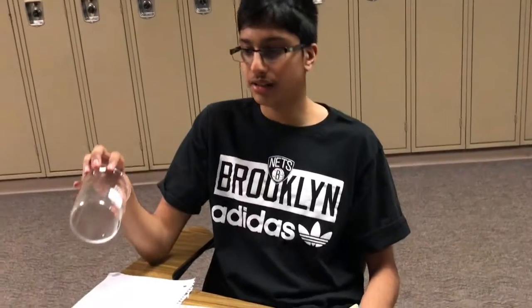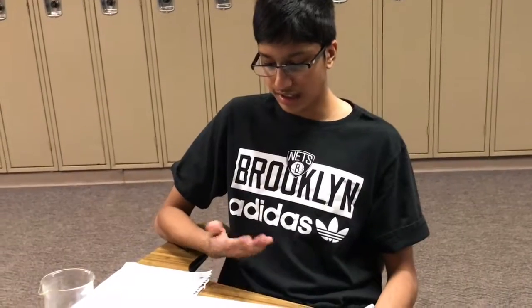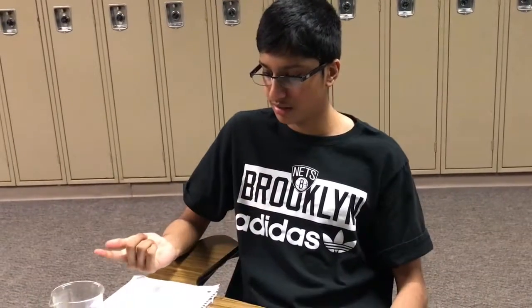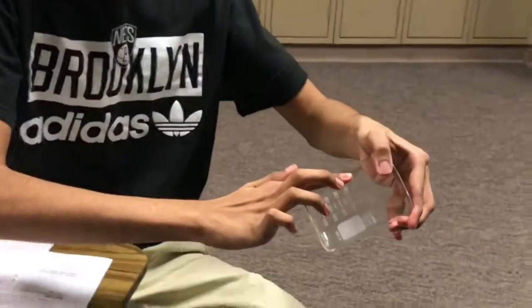Okay, so I'm going to show you how to lift latent prints. First you want to make sure the glass or whatever surface is clean, otherwise it won't work. You won't be able to see the minutiae of the fingerprint. And you want to get oils on your skin so it's more visible on the glass. So you want to run your finger along the side of your nose or the back of your neck, or maybe behind your ear, because these are the most oily parts. And you can just place it right here, anywhere.